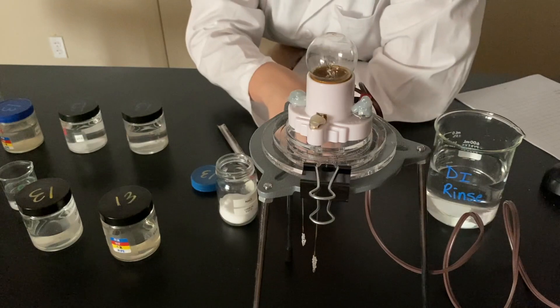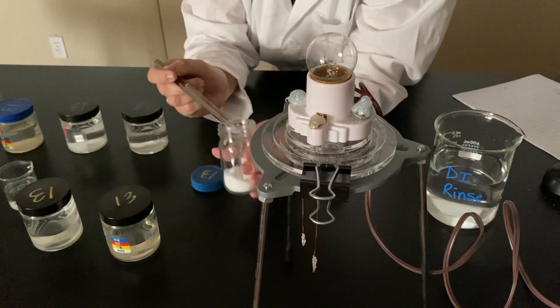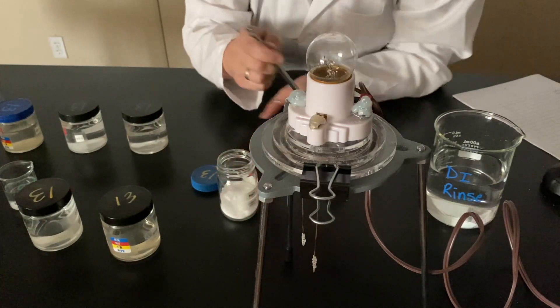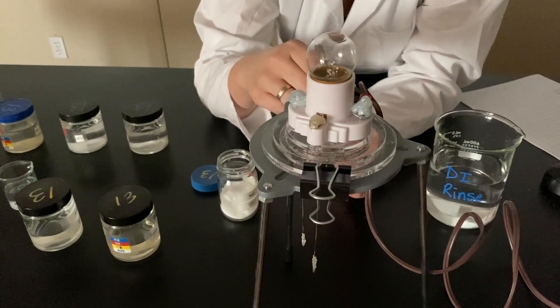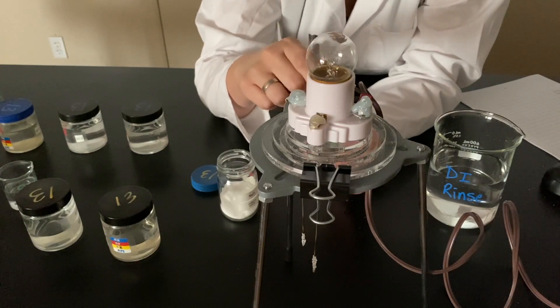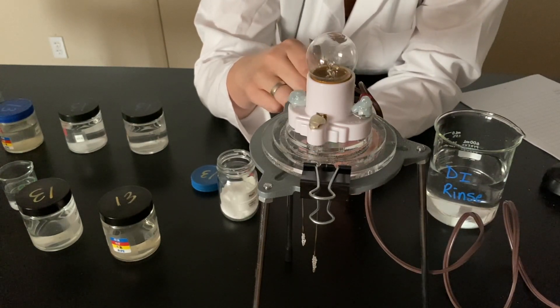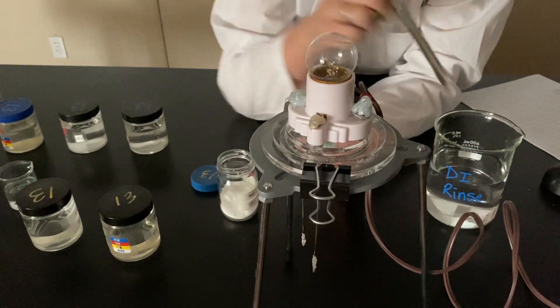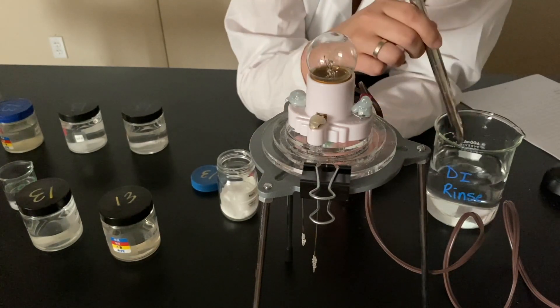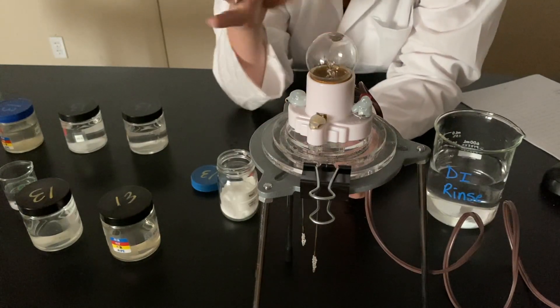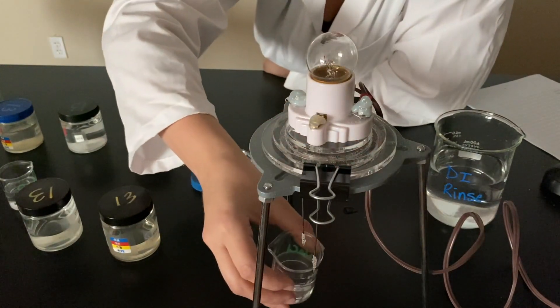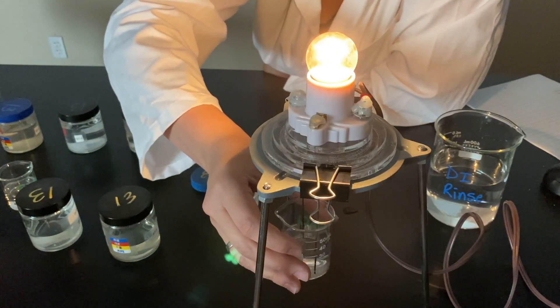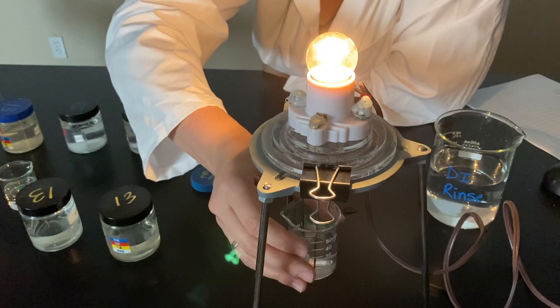Then we have table salt, NaCl, sodium chloride, aqueous. So, we pour some NaCl and some DI water. You have to make sure you use DI water to make your solution. Otherwise, if you use just tap water, you might get your data contaminated. All right. So, salt water. NaCl as an aqueous solution.